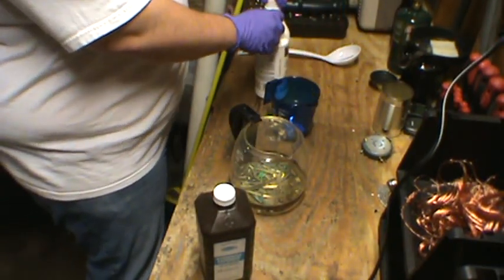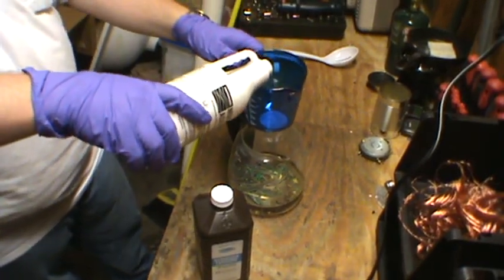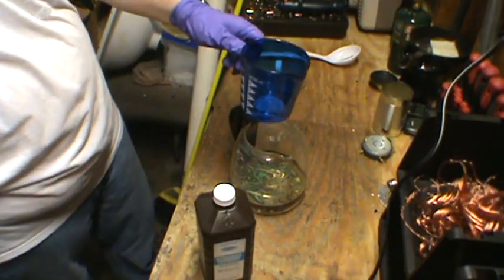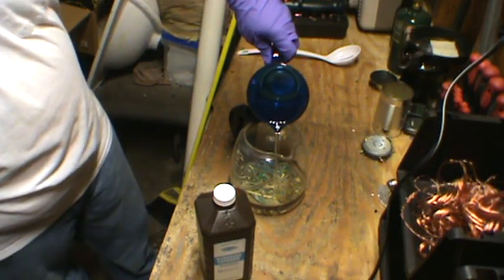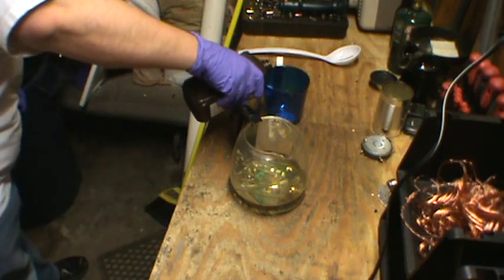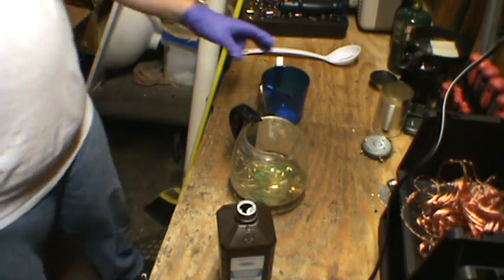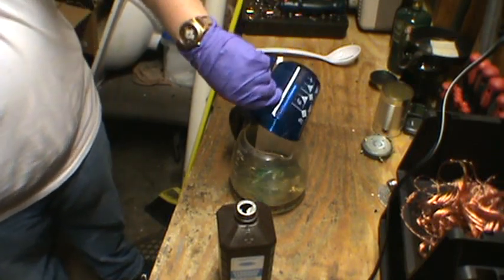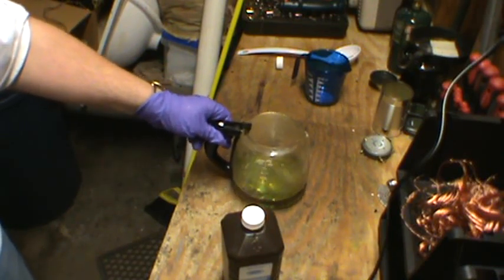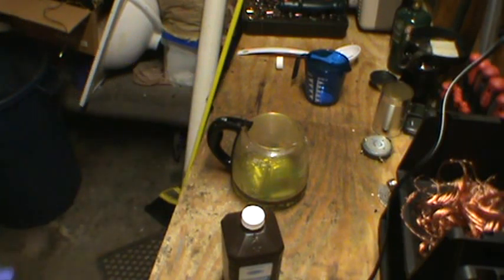We're going to start off with the acid. You want to pour in just enough to cover — in this case, 200 milliliters. And to that, you're going to want to add 100 milliliters of hydrogen peroxide. The fumes from this will start to get pretty intense. You're going to want to stir that around a little bit. It's going to start to turn a nice emerald green color, and that means it's dissolving the copper. The first few hours of this reaction are going to be the most prolific, so this is the time to move it outdoors.